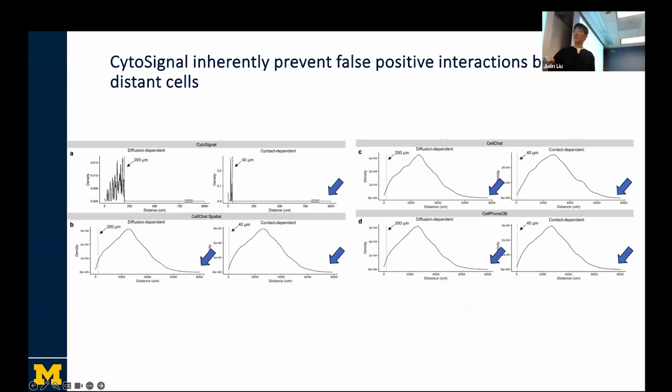So this one, we really want to see whether CytoSignal outperforms all the other methods in the field. Here we benchmark CytoSignal with three really famous cell-cell communication software: CellChat, CellPhoneDB, and CellChat Spatial.